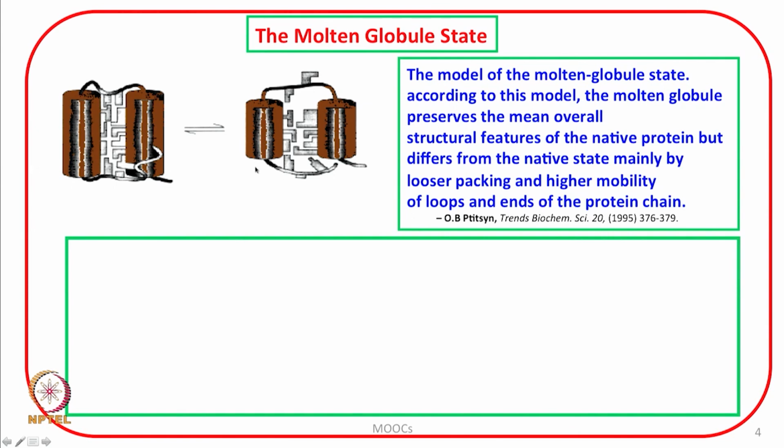The difference between the two is that some of the structural features of the native state are retained, but some of the structural features of the native state are lost.